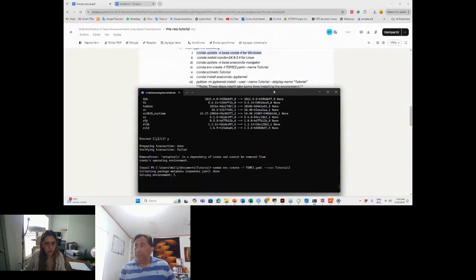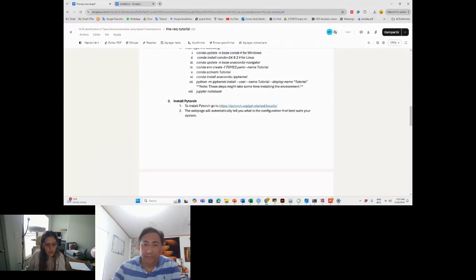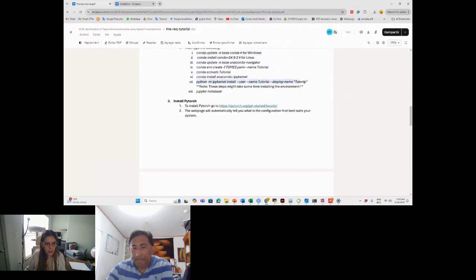Okay. Well, do you want me to explain all the steps to install it? Yes, go ahead, please. So, after it finishes loading this step, we're going to have to activate the environment that we created. It should now have everything that we need to work on. So we're going to activate it, and after that, we're going to install IPyKernel. IPyKernel helps Jupyter recognize all the packages that we just installed. So we have to first install it and then run this line.